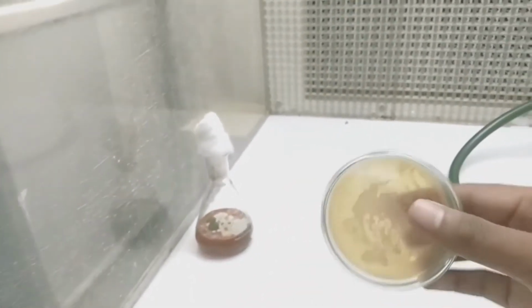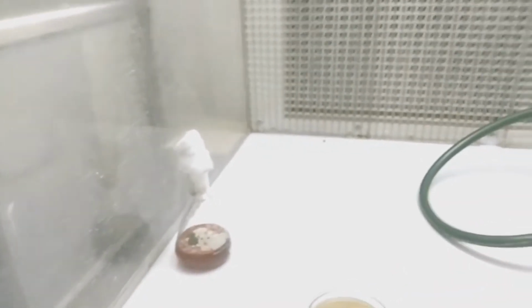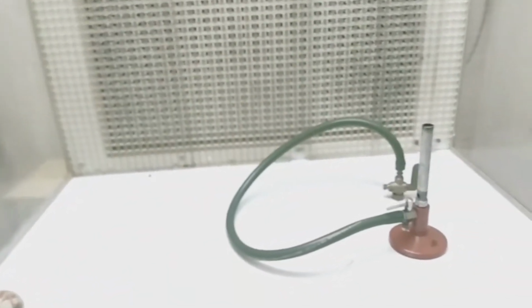Second, when we do work in laminar airflow, we have to work on microbial cultures, different types of microbial cultures such as fungi, bacteria, different varieties of cultures. So we have to do work in a sterilized condition. That's why we use this laminar airflow, so that the fresh air will come. As you can see, this chamber is totally packed. That's why all the contamination will be reduced outside, and we have to work in a sterilized condition.